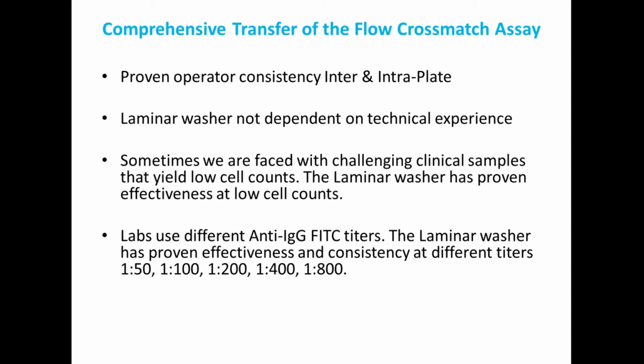I would like to start off this presentation with this angle, and I will conclude my webinar with some new data that has influenced me to continue working with the Laminar Wash system in hope of revolutionizing our approach to challenging samples for histocompatibility testing.